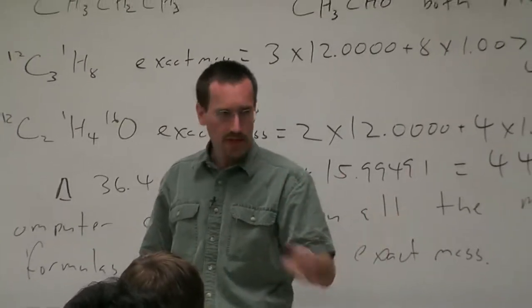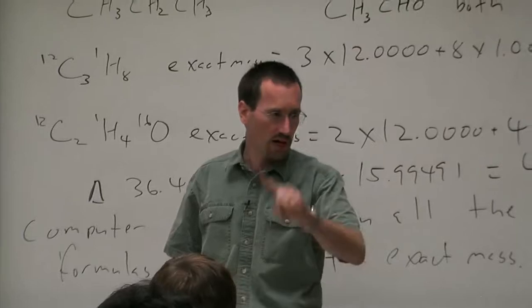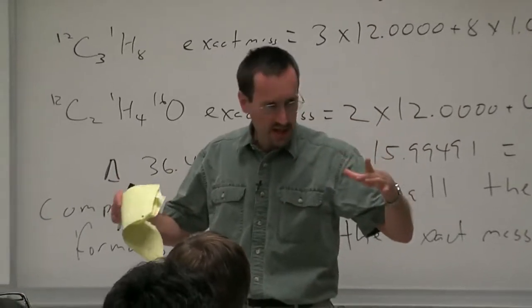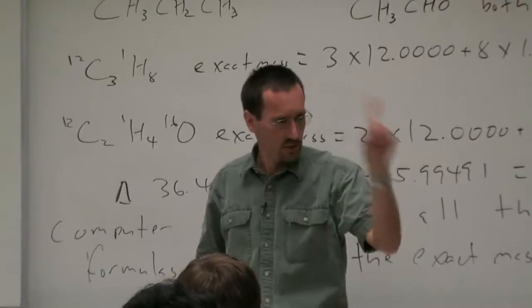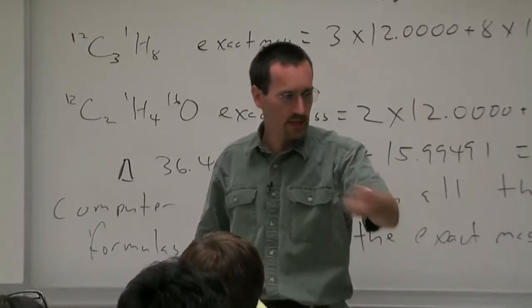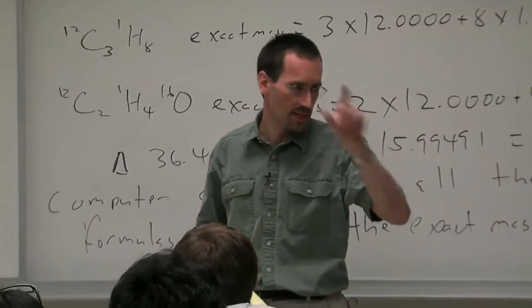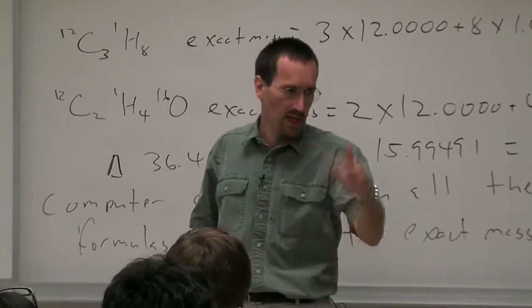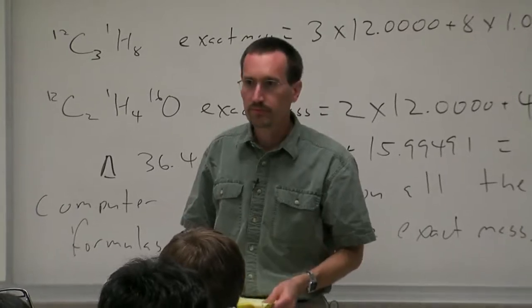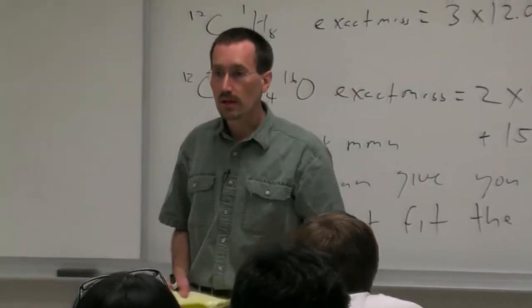What you're doing is basically having a little cyclotron, a magnetic field, and a varying frequency, and only ions of a certain frequency will circulate in resonance. And so you tune your resonance, and because you're right on resonance, you're getting the ion of this mass.